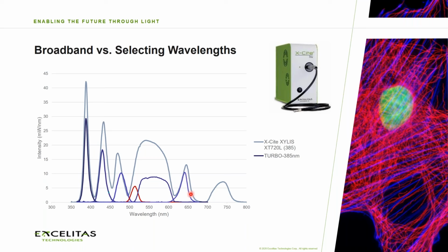You can get through all those colors going on and off very quickly, because it's not relying on a filter wheel, and it's not relying on lamps being turned on and off. So you would use a selectable wavelength system with separate LEDs if you wanted higher throughput.